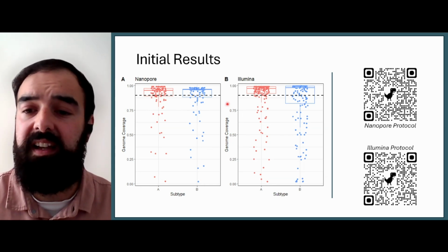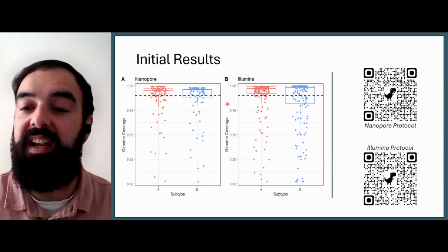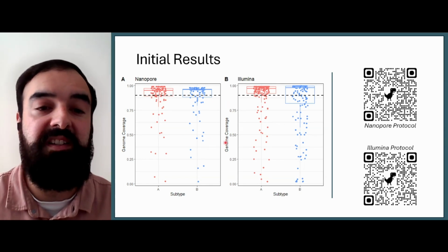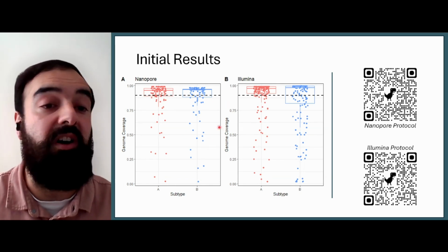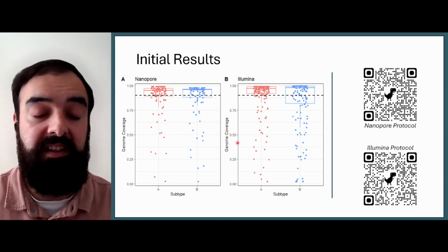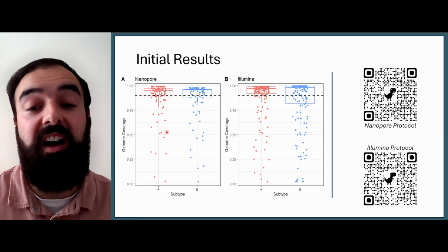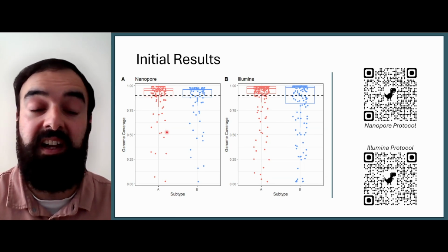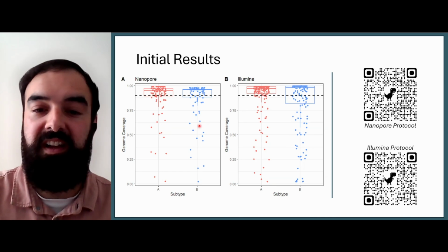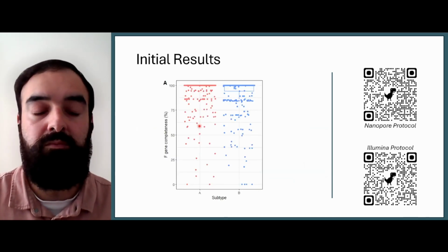The samples tested here were not selected based on their CT value, but the majority of them would be less than CT30, with those over that accounting for a decent proportion of the sequences that did not achieve the 90% coverage mark. An important point to note is that the nanopore data was produced with the older R9 flow cells and kit chemistry, and we hope to test the new kits in the near future, and hopefully we'll update the protocols once that has been achieved.